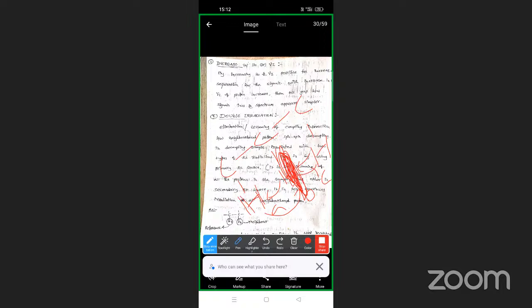This proton appears as a blur. So in the spectra, we will observe the signal for the HA proton, and you will observe the signal for the HC proton, and the HB proton appears as a blur.